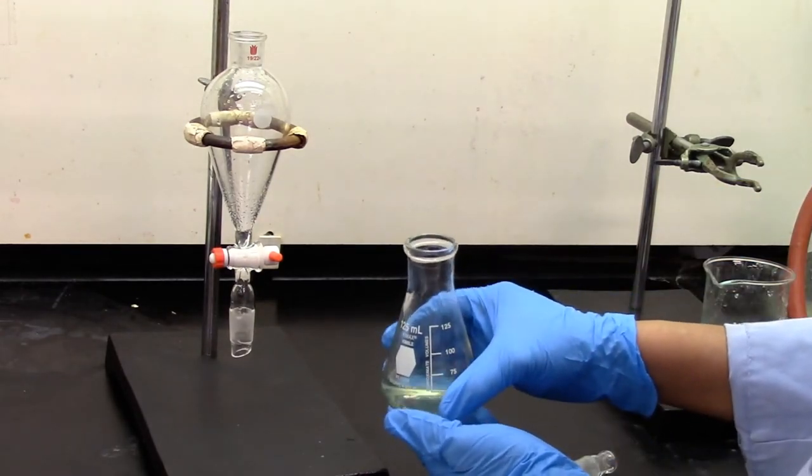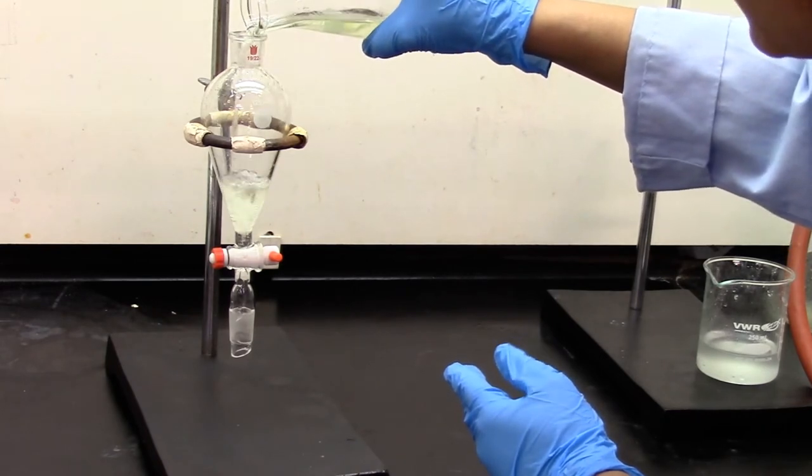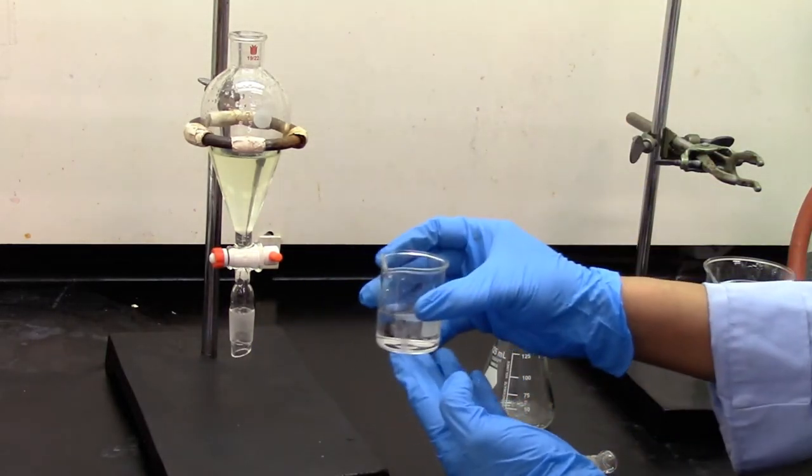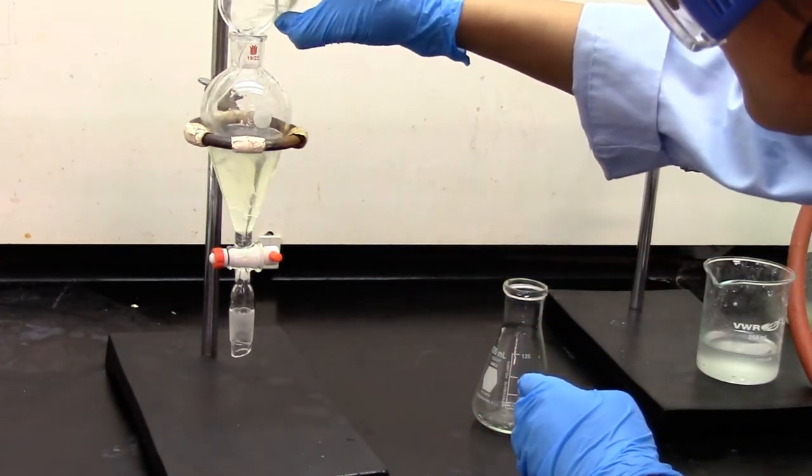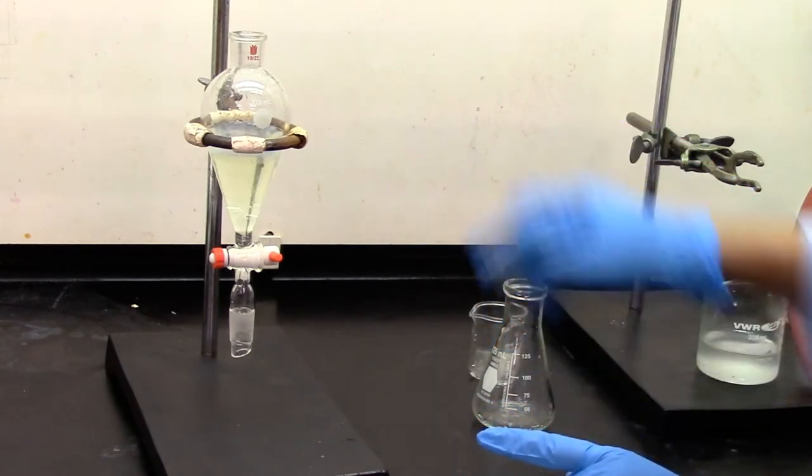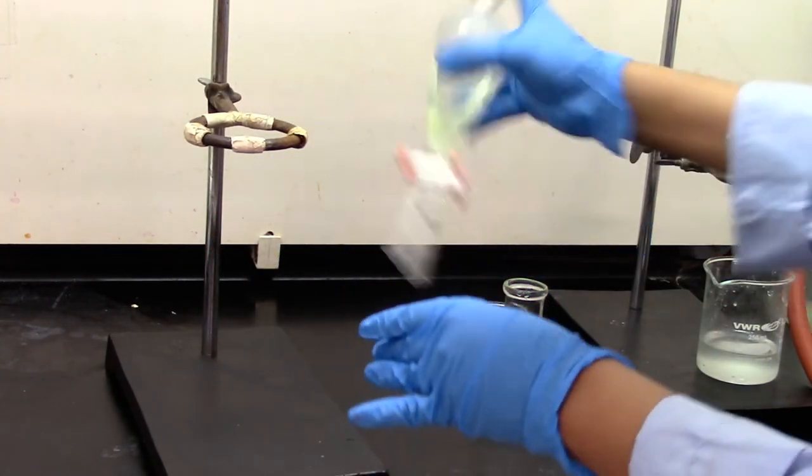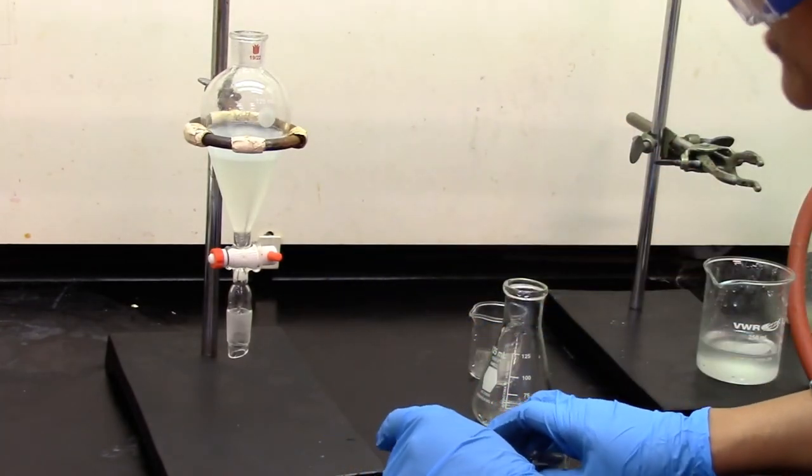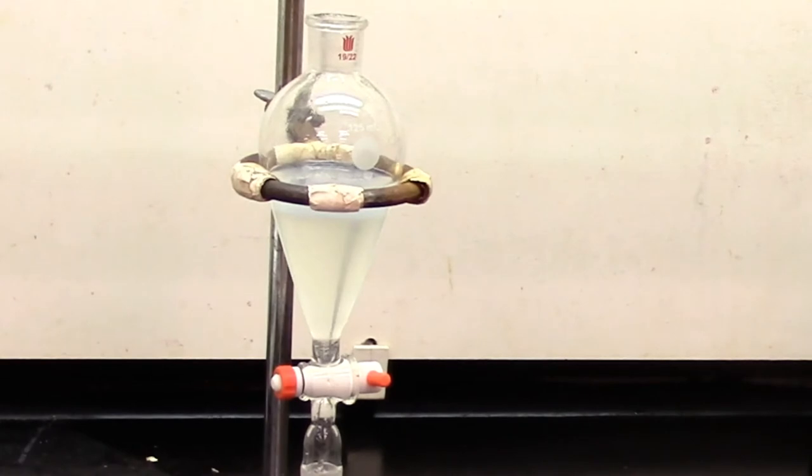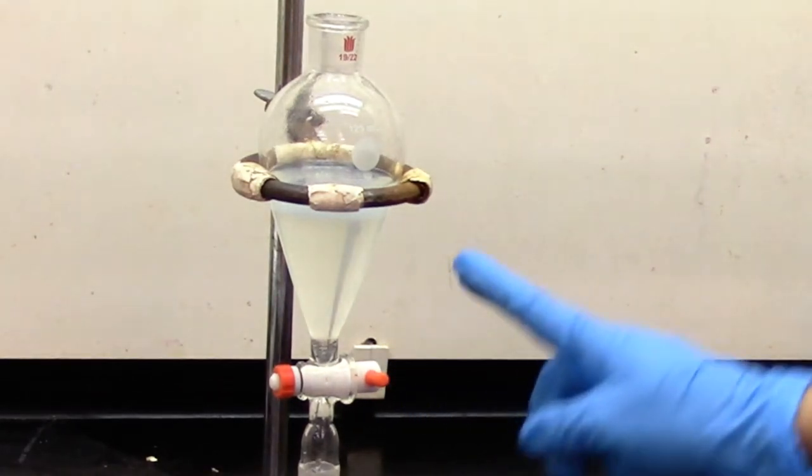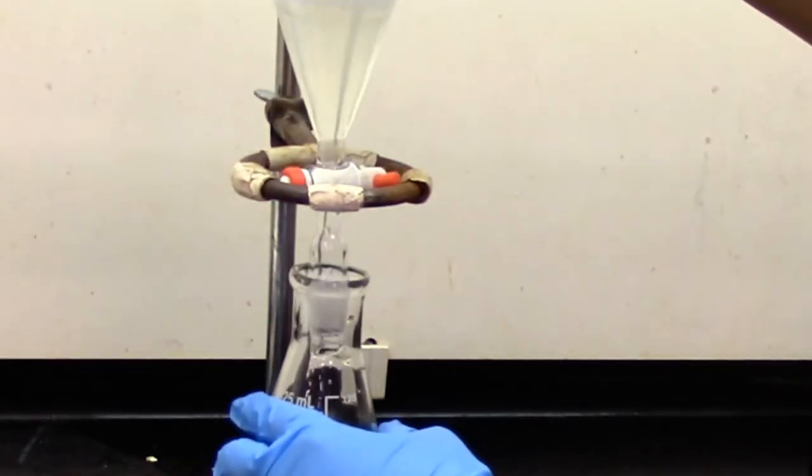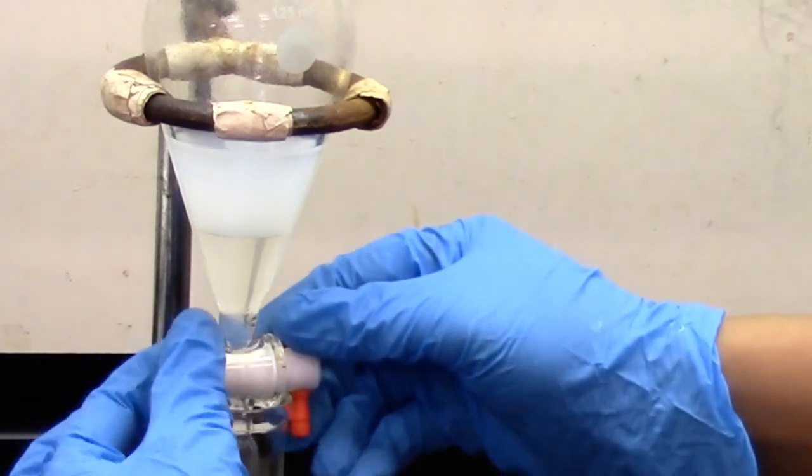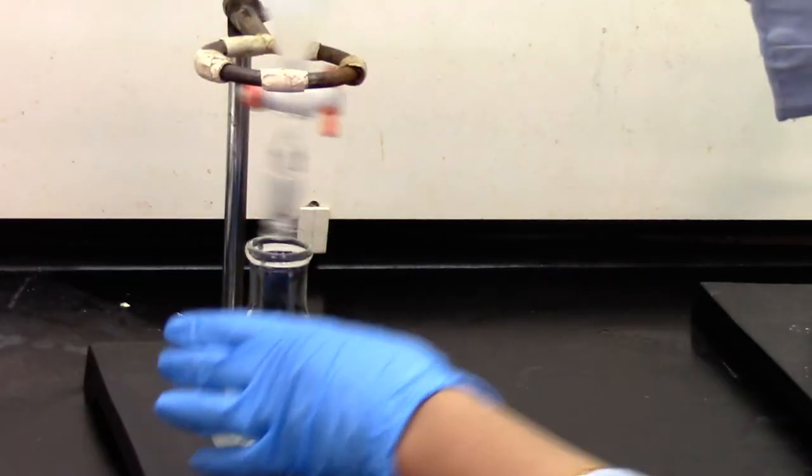The dichloromethane layer, which contains our product, goes back to the separatory funnel. And I'm going to add 25 mL of saturated bicarbonate solution. This should neutralize any excess acid that's present with the product. Give it a mix. And then uncap and let it stand to separate into two layers. The bottom layer goes into a clean Erlenmeyer flask. The top layer is a discard.